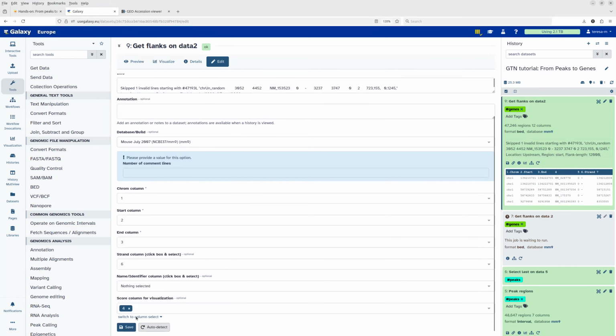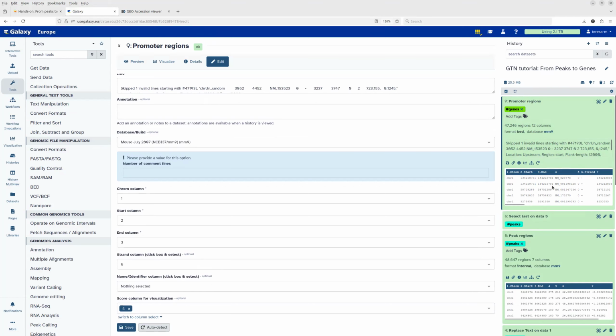And of course, we need to then save the file. And voila, we have a new file name. So I can now safely delete this run that failed for me because we have the file here. I hope it worked out fine for you.